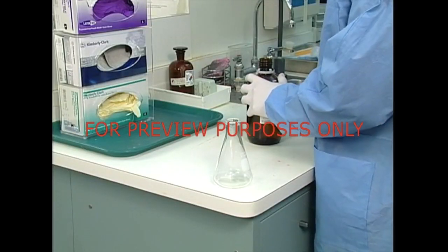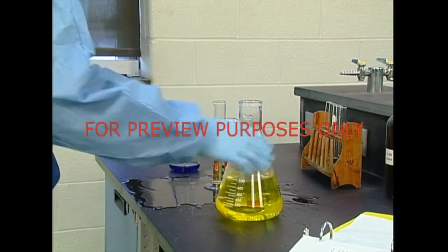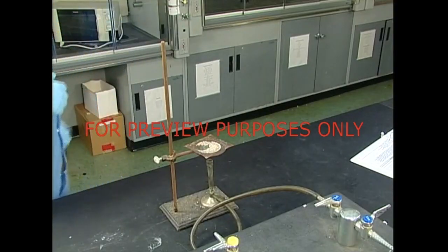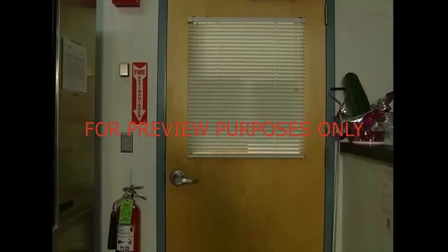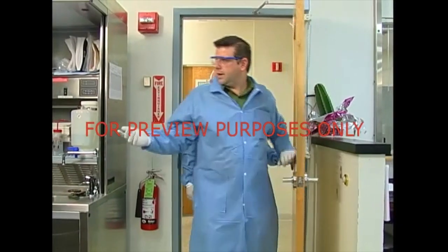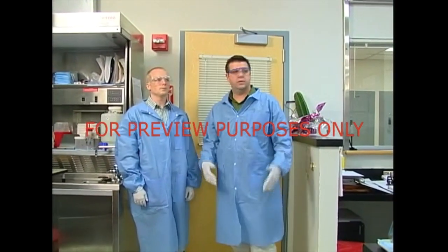We're all human, no matter how many years of school or work we have under our belts. And when things get hectic, we often suffer from an overwhelming urge to do the wrong thing, to take shortcuts and ignore safety precautions. So if you're new to your lab, while you're learning where the light switches are, you should also learn the safety rules. There's a wealth of safety information you should know.